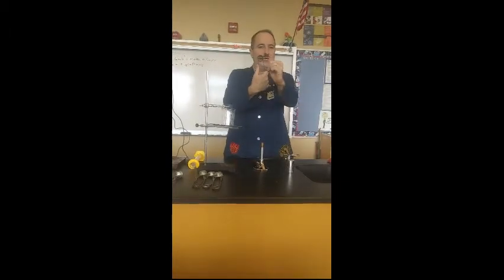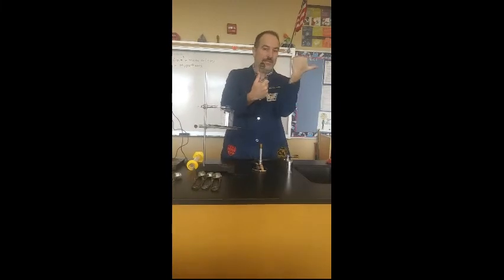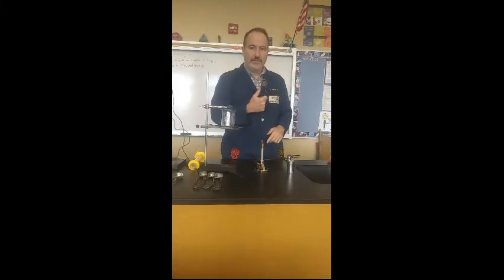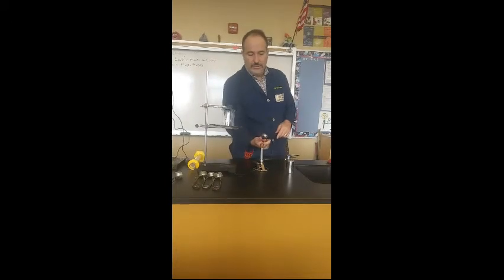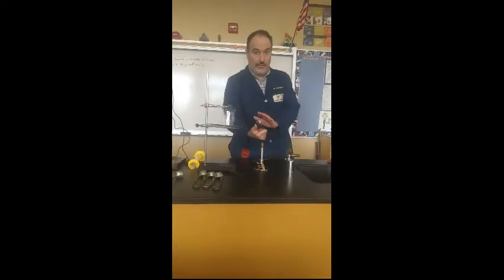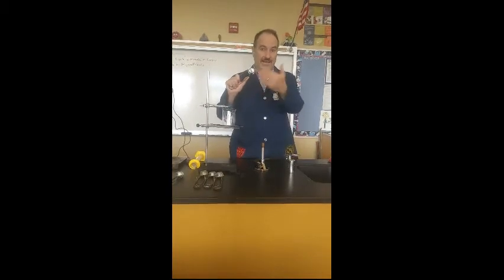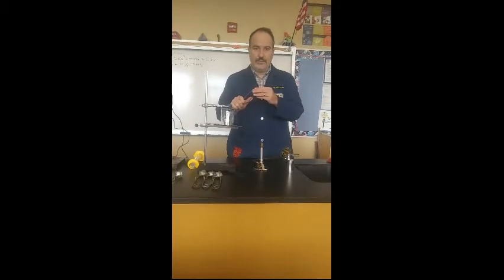So you want to make sure you position your thumb so that you can push it this way as well as to the side, kind of in a diagonal way, so that you can get a good spark. And you want to make sure you can do that when it's upside down facing away from you. Let's put it this way: if you can see a good spark from the back side, that means you're good, okay?